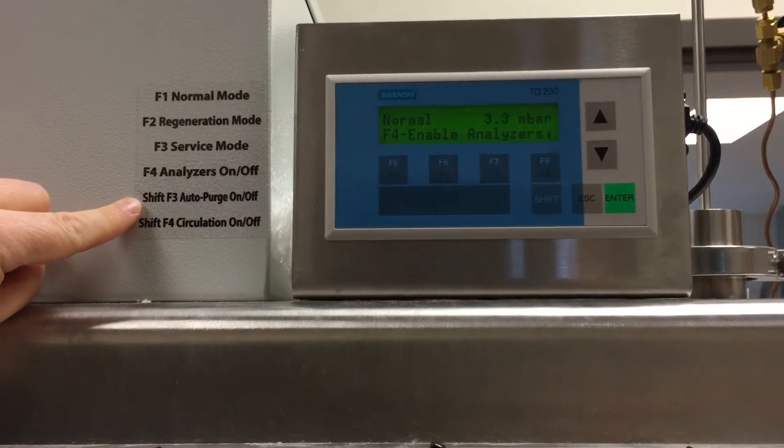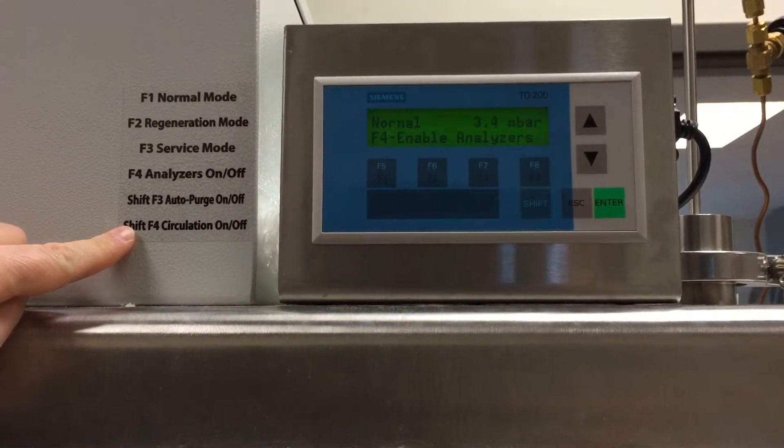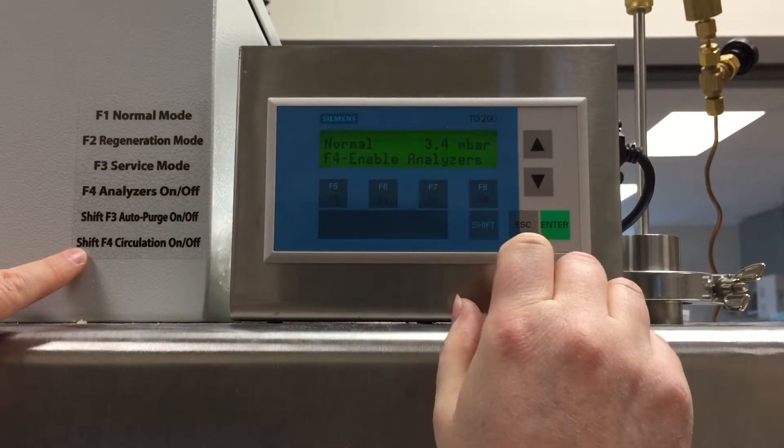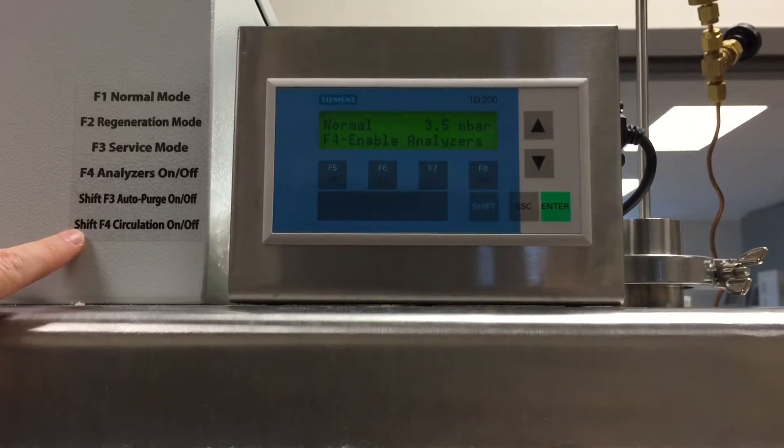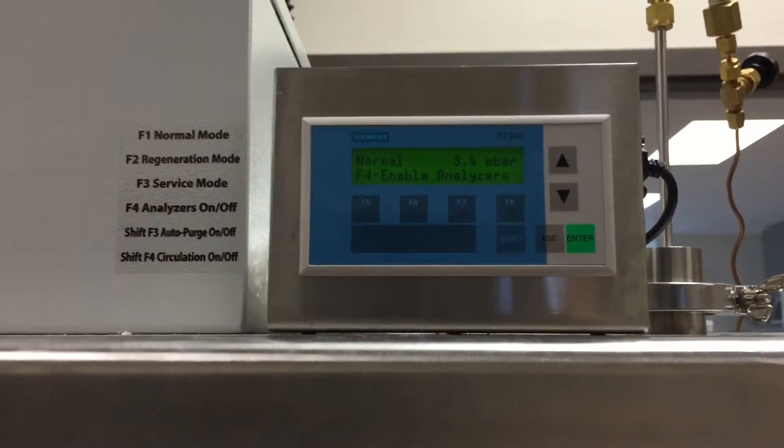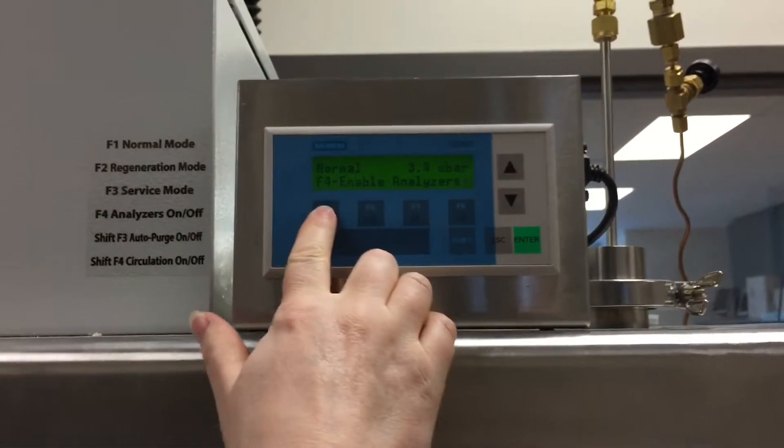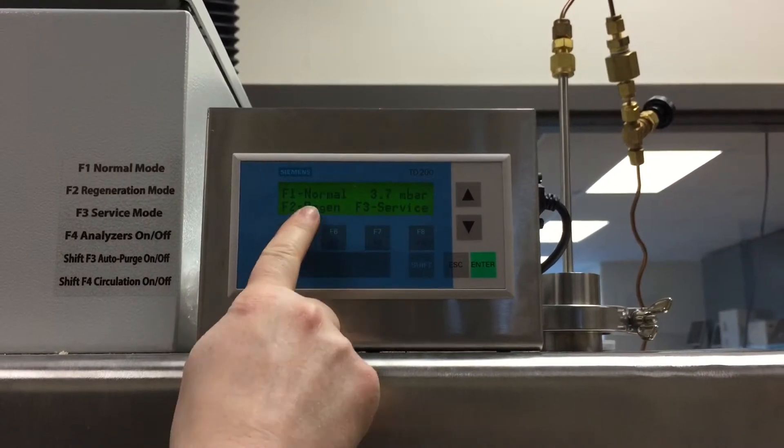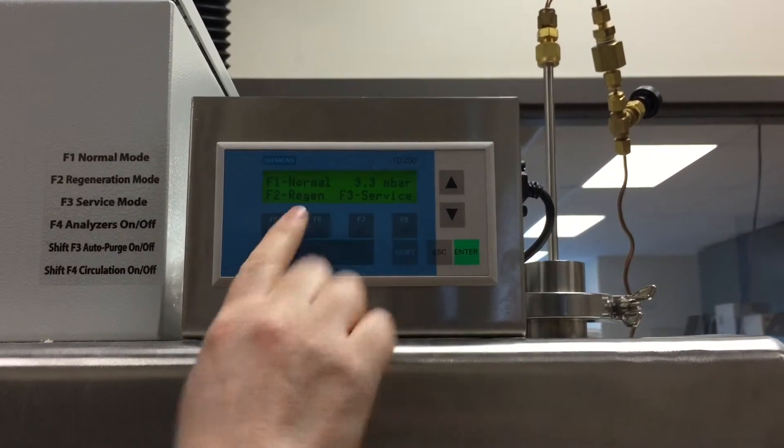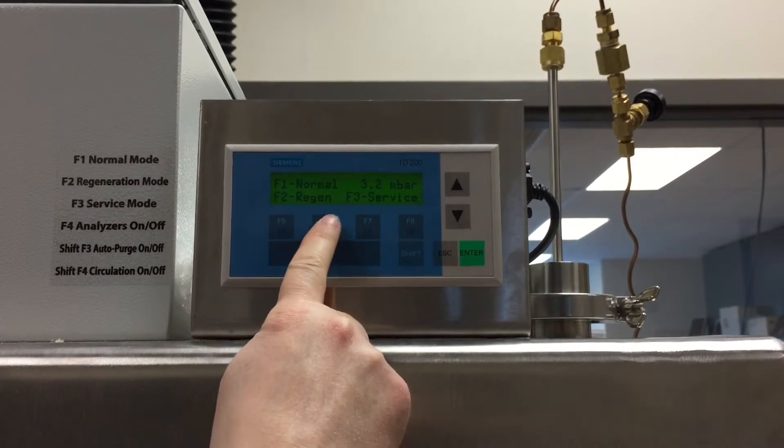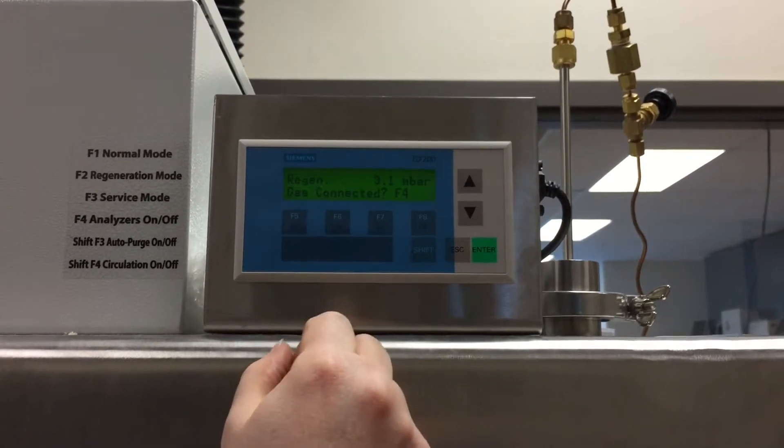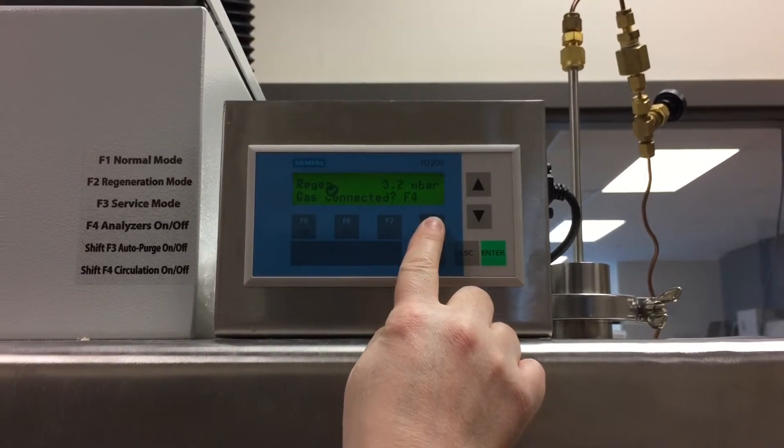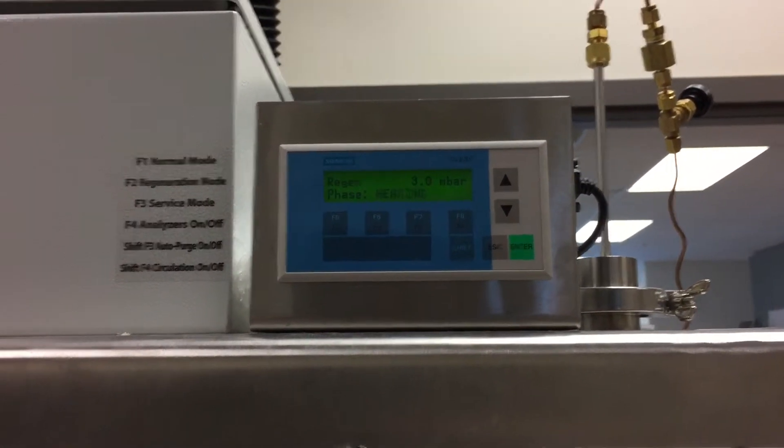The only things that you have to do to start the regeneration is you have to turn off the circulation. So you just hit shift F4 and you can hear that noise of the circulation turning off. All right, next we go to hit F1 and go to the regeneration screen and it says F2 for regen. Just hit F2. It asks if the gases are connected and they are. So now we hit F4. And that's all that you have to do.